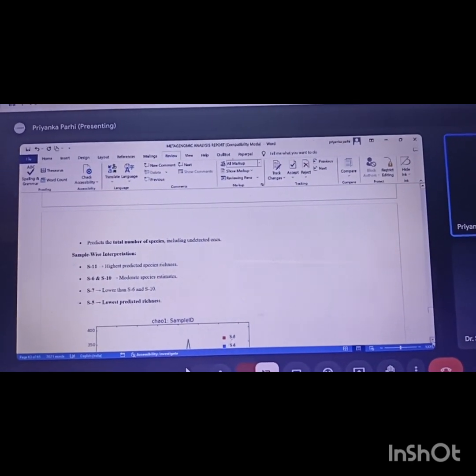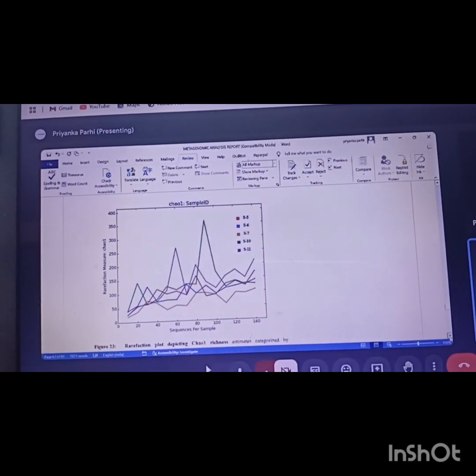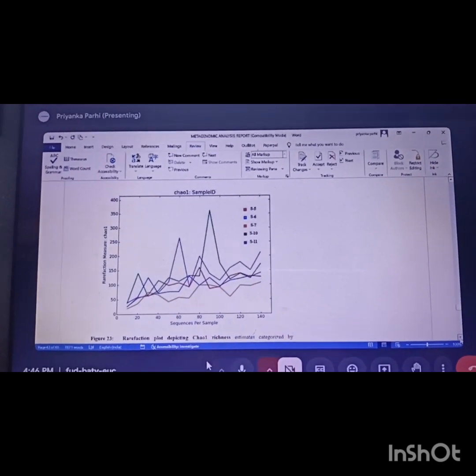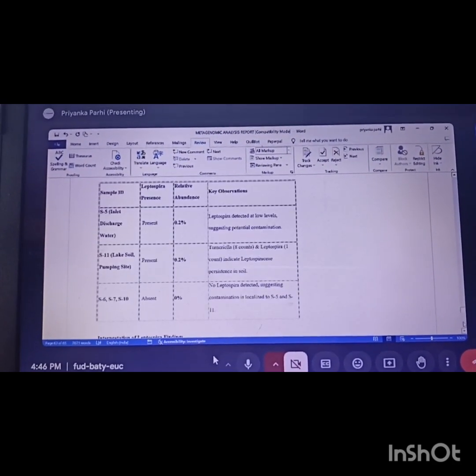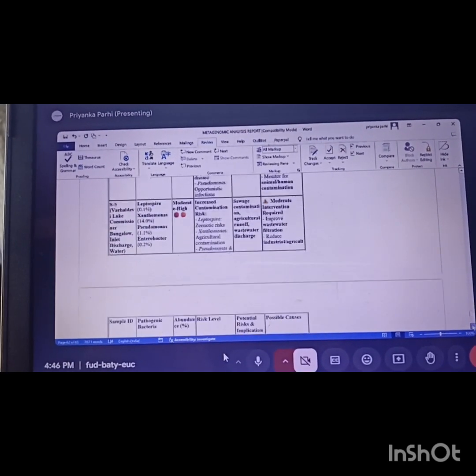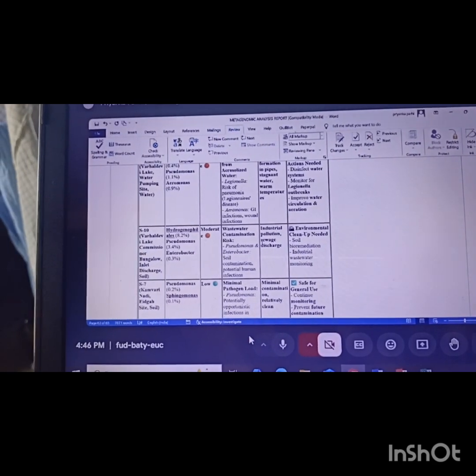So if we go here quickly, this only I was talking about, that peak, you can see that S10 was high, right? So in that species, Pseudomonas species, it was high. So maybe, no, I think in S10 the highest is Leptospira, if I'm not wrong, let me check. Go up, go up. Okay, go to S10, then we'll come to know. Yeah, see S10, Pseudomonas and Enterobacter.